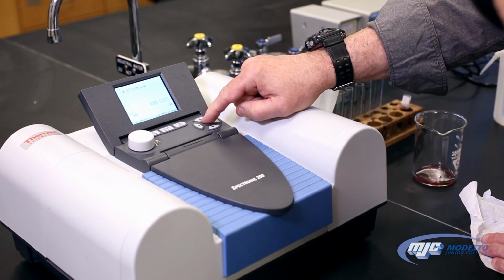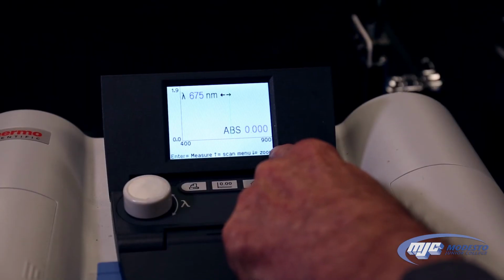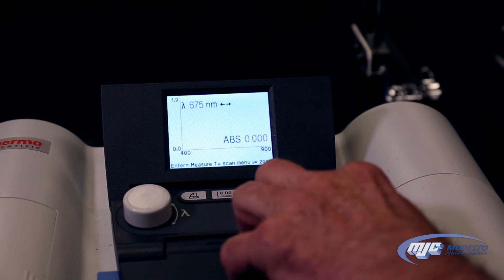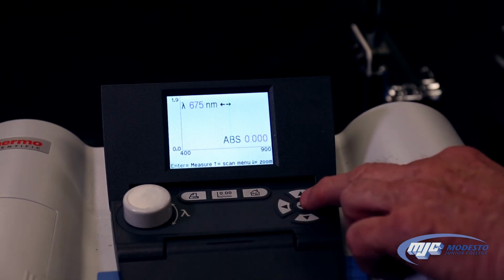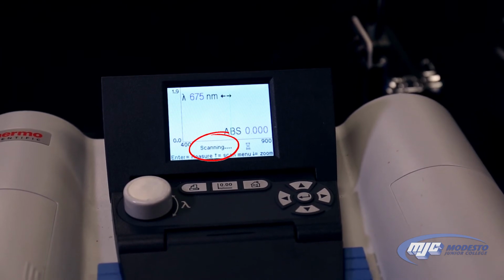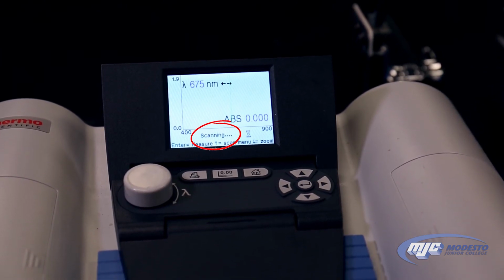Just press enter, which is this arrow right here. And when we do, it's going to scan through 400 nanometers all the way through 900 nanometers, measuring the absorbance along the way. And it'll give us a graph. See how it says scanning down there? When that goes away, we'll see our graph.